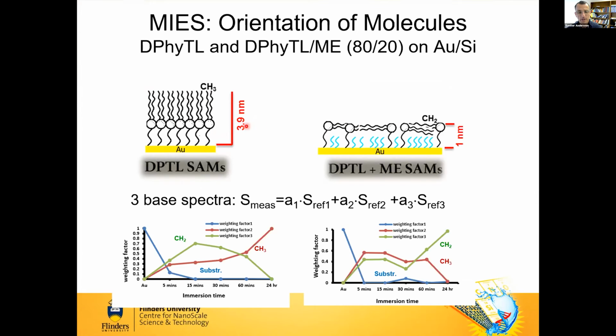The difference between these two we could determine with the electron spectroscopy technique with the metastable helium atoms. We could show that this surface is in fact terminated by CH3 groups, so we saw only these ones in the spectra. And here you found that the molecule is actually lying flat on the surface. So we can determine the structure and the thickness of the surface at that level of accuracy.